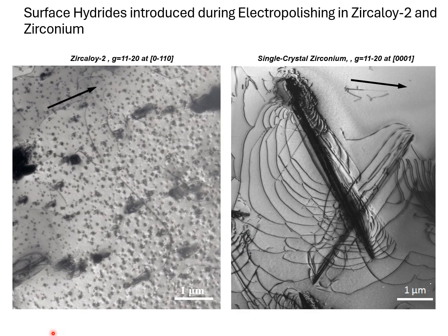Okay, so I think that's about it. Sorry for rushing through this. I just wanted to get some notes out about artifacts and pitfalls and points to look out for if you're doing any electron microscopy. I have a couple of other lectures on my YouTube that go into more detail on diffraction theory, and I wanted to keep off that in this case because I just wanted to show some examples of the pitfalls of doing electron microscopy.